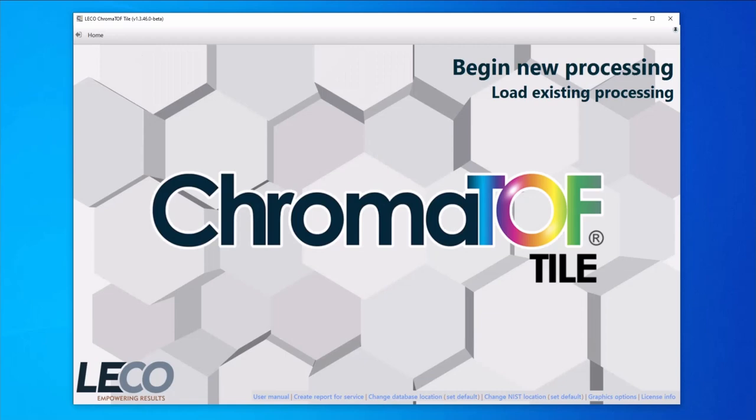ChromaTOF Tile can simplify this task by rapidly comparing the raw data to find the retention windows where there are differences between the samples. All of the masses are compared, so even features that are not obvious in the TIC can be uncovered.